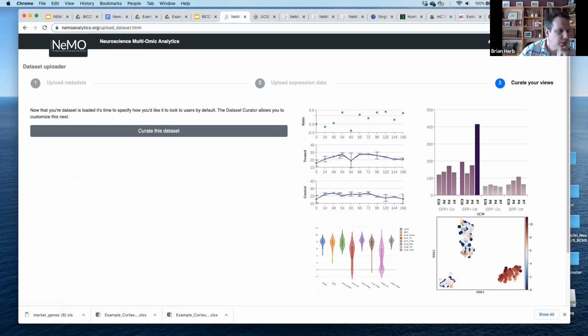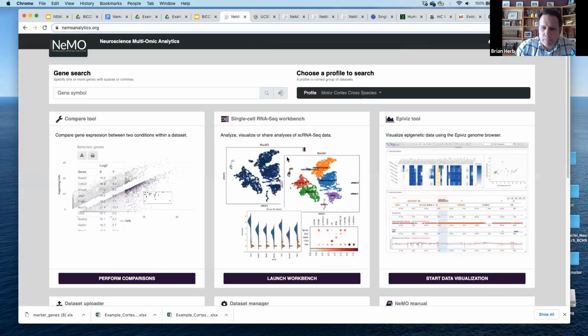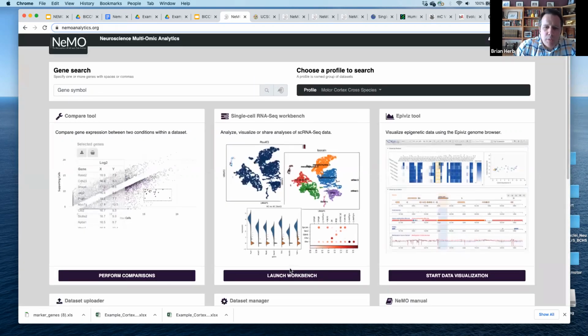All right, so how are we doing at this point? Everyone's got their data uploaded? I'm seeing, I think we're good. Okay, again, just throw a question in the chat if you need help. So we're going to navigate back to the front page. So clicking on that NeMO, and we're going to get into the workbench right smack dab in the middle of the front page.